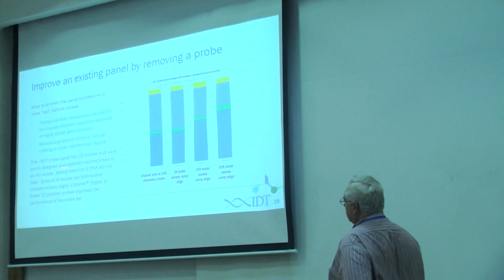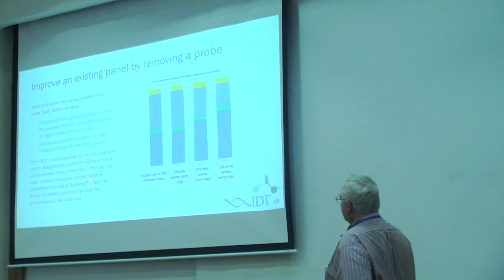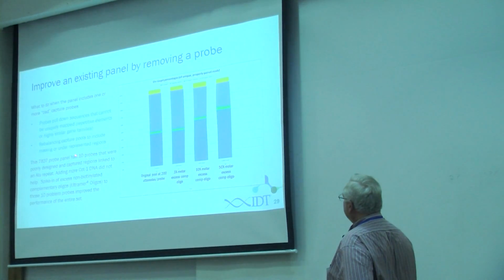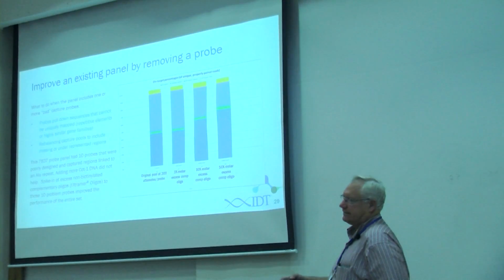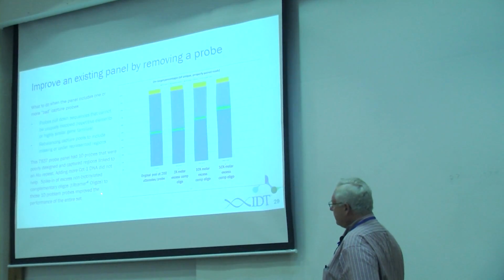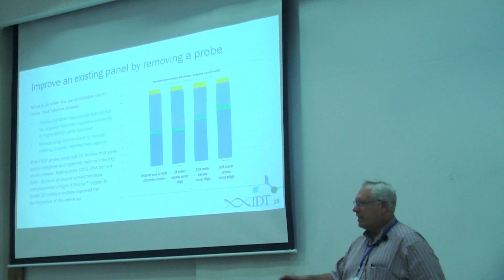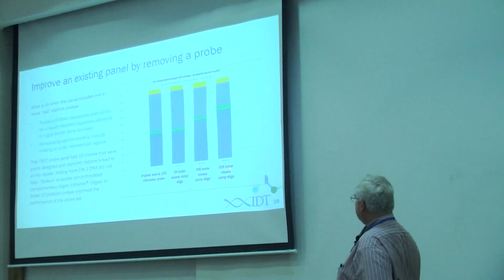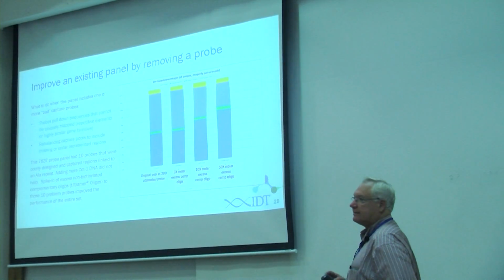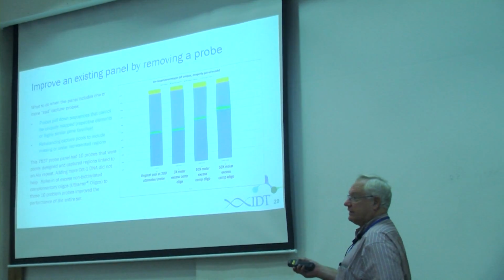And it was a small panel, under 8,000 probes. And the on-target efficiency was kind of poor. And upon deep study, we figured out that they had a few probes in there, it was actually only 10 out of 8,000, that weren't properly repeat masked. And they were dragging down other stuff that they didn't want. And what we did was we made anti-baits, anti-probes. So we made complements to it. And if you spike in the complements at 3, 10, or 50x, you can get rid of those baits. And in essence now they're taken out of the solution function, even though they're physically still in there.